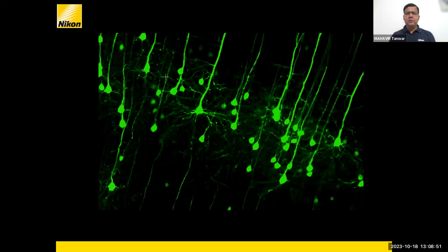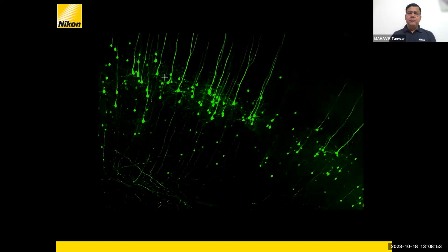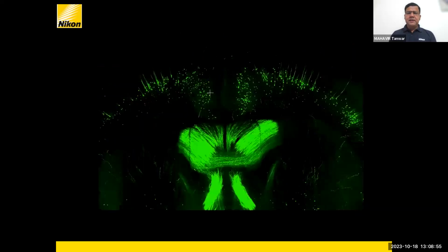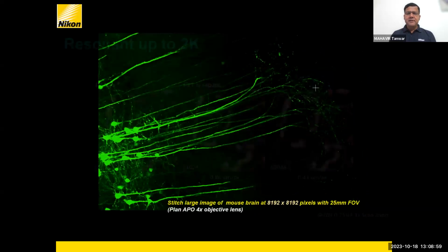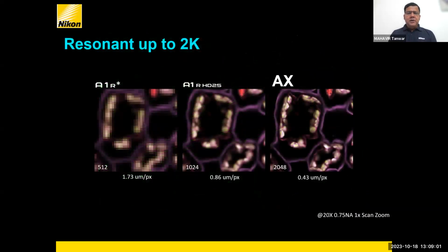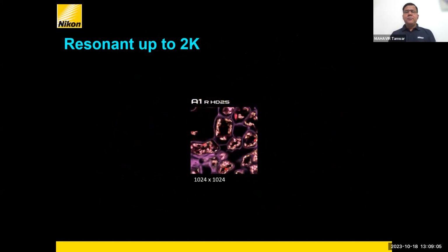So this is a whole view, right? These kinds of samples you can image very, very fast using these systems. These days the systems are built for a more central facility, which can cater to a wider range of applications. Somebody will say, I want to do fixed cell imaging. Somebody says, I want to do fast imaging.